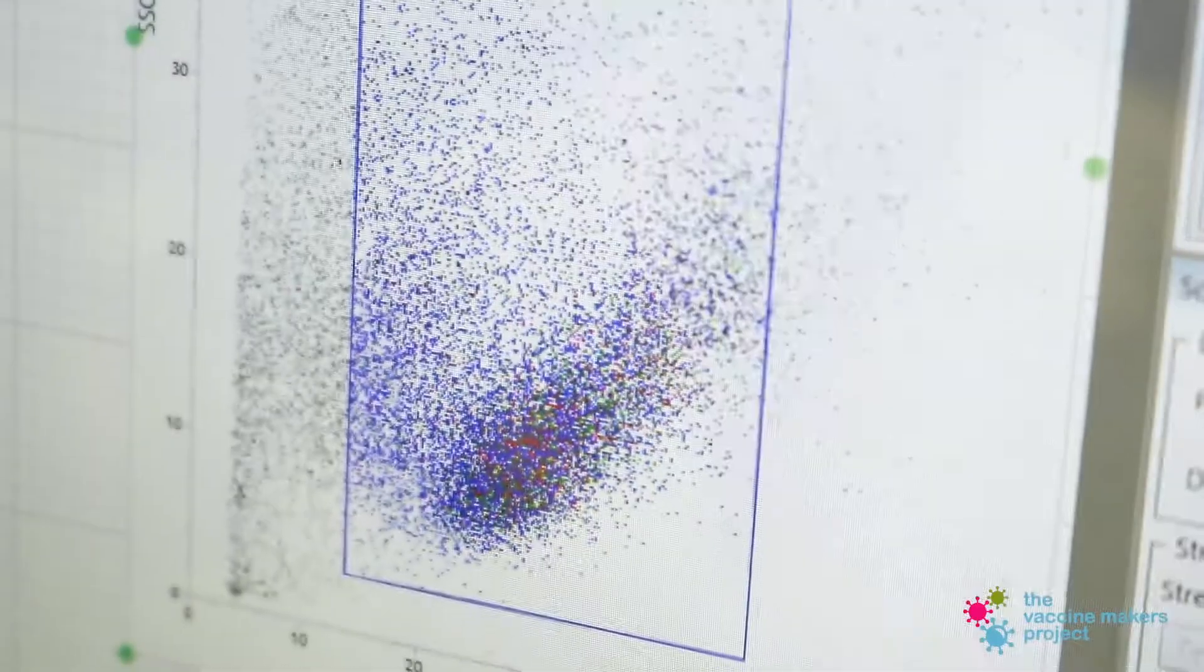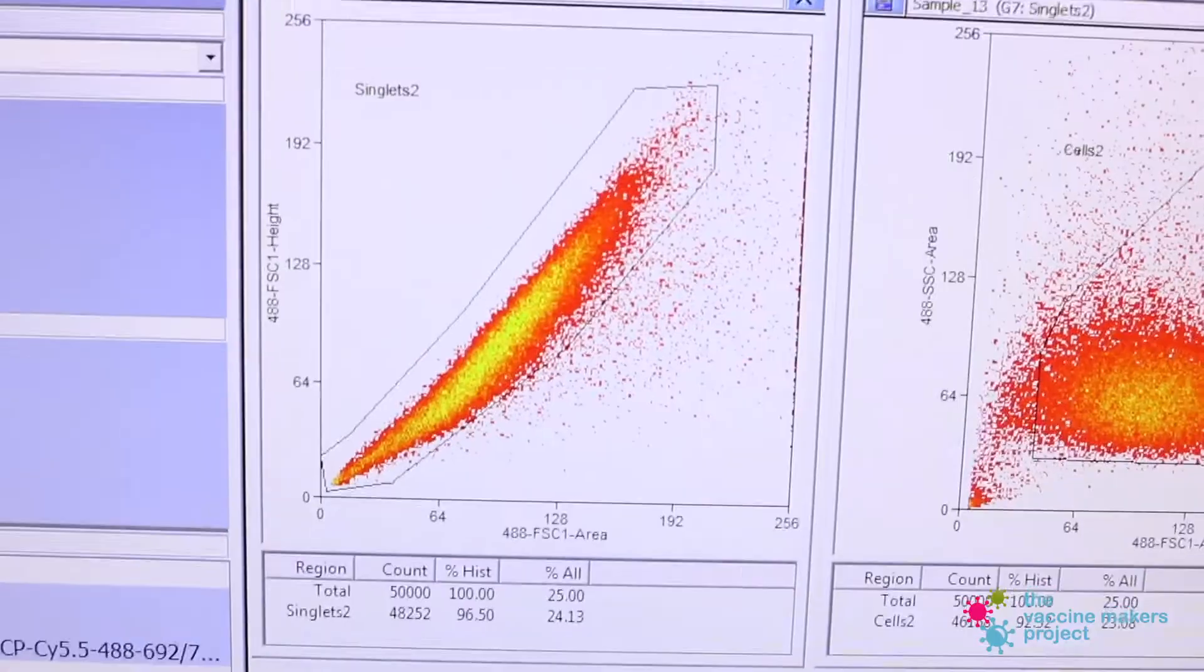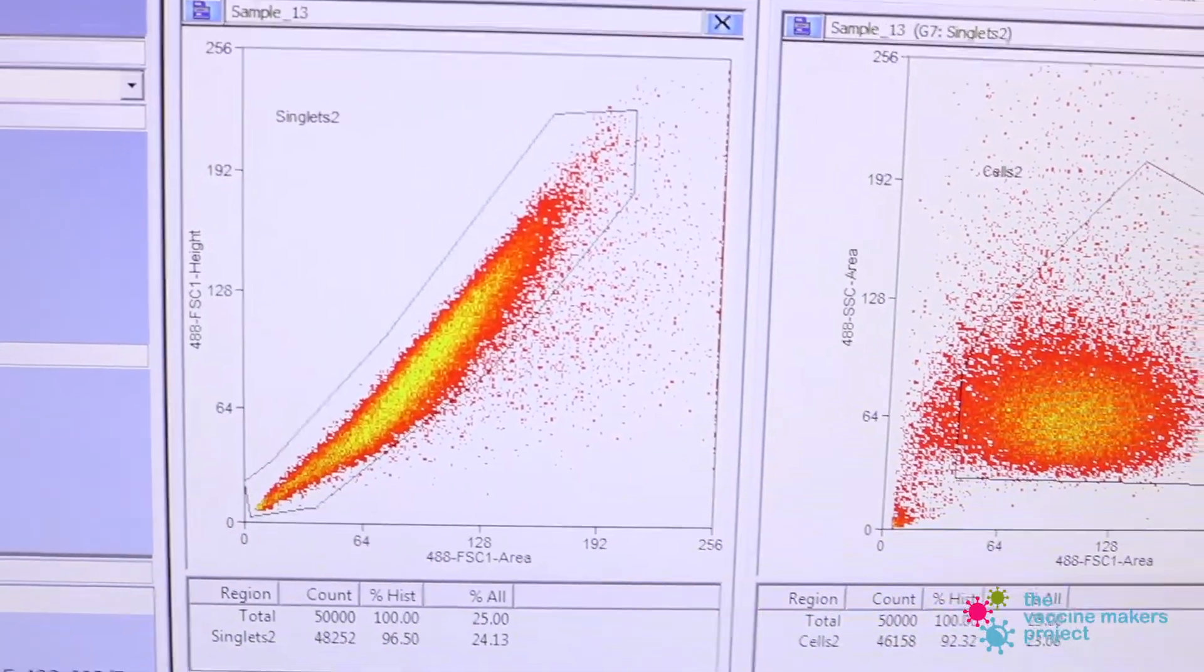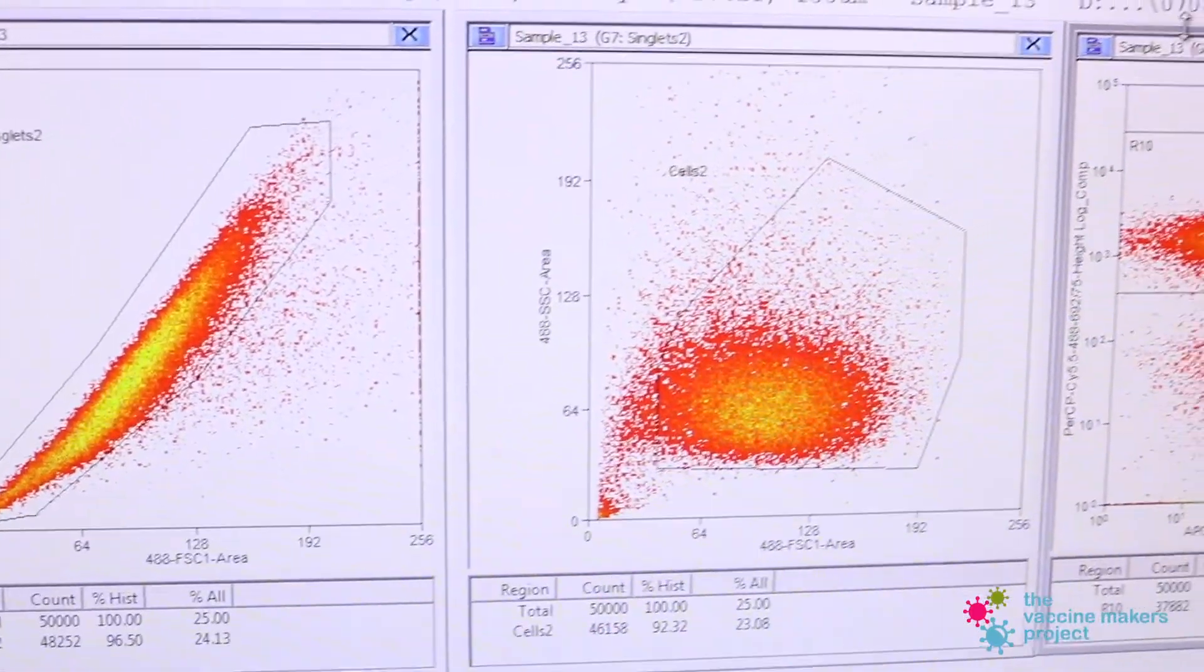The first graph we look at when analyzing data is our forward and side scatter. It gives us a quick overview of what kind of cells may be in there per size and complexity.